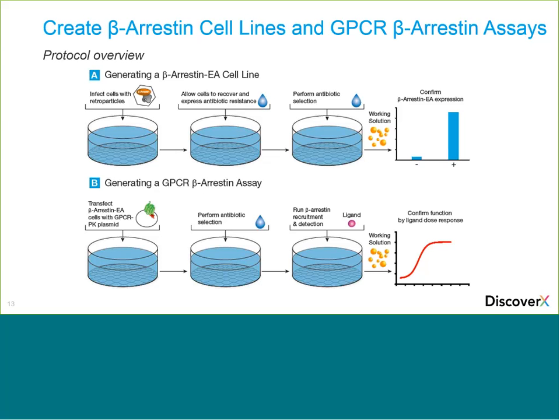The second example is the opioid receptor, the delta version. We ran a second messenger assay, in this case a cyclic AMP activation assay, and the beta-arrestin recruitment assay. With the cyclic AMP assays, these typically show saturation effects for some of the ligands. This is just due to the natural amplification system of this particular pathway. So the beta-arrestin recruitment assay was nice, and it showed the superagonist that wasn't seen in the cyclic AMP assay, as well as a partial agonist.